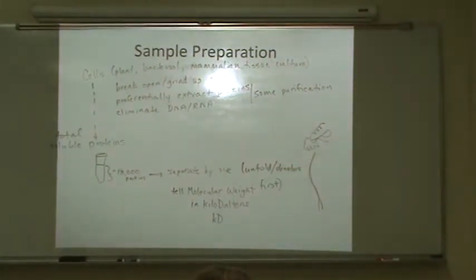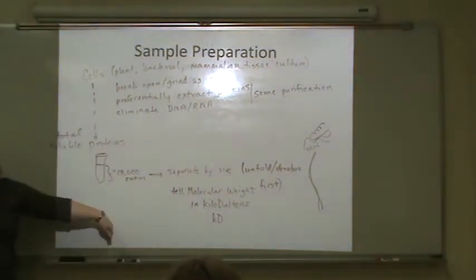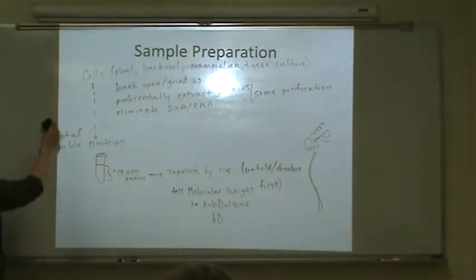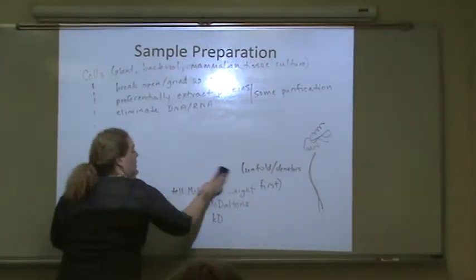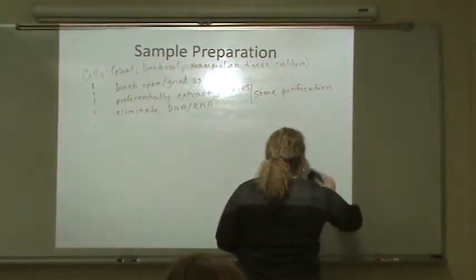I've got some notes here to myself. I'm going to write again on sample prep. You may have to make more room on your slide. So that's what we want to do during sample prep. We start with grinding, and then we want to get to the point where we separate things by molecular weight.